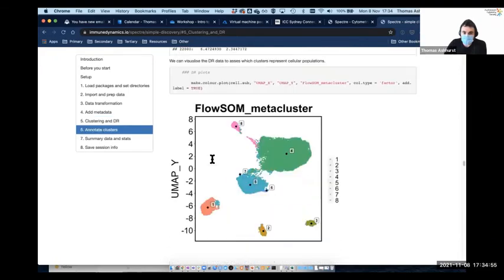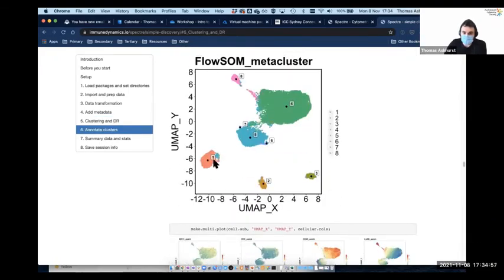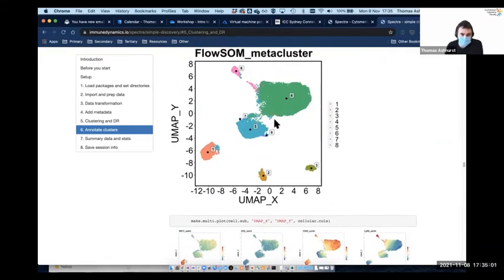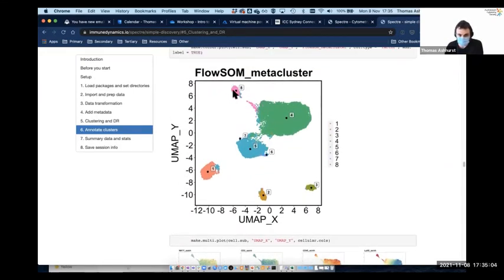But just to give you an idea of what we end up with in the clustering steps, we end up with essentially two things. This plot is a dimensionality reduction plot, and this is simply a technique that allows us to plot cells on 2 dimensions in a way that represents higher dimensional relationships. So if you imagine that each dot here represents a cell, the 2-dimensional spatial arrangement roughly correlates to how related the cells are.